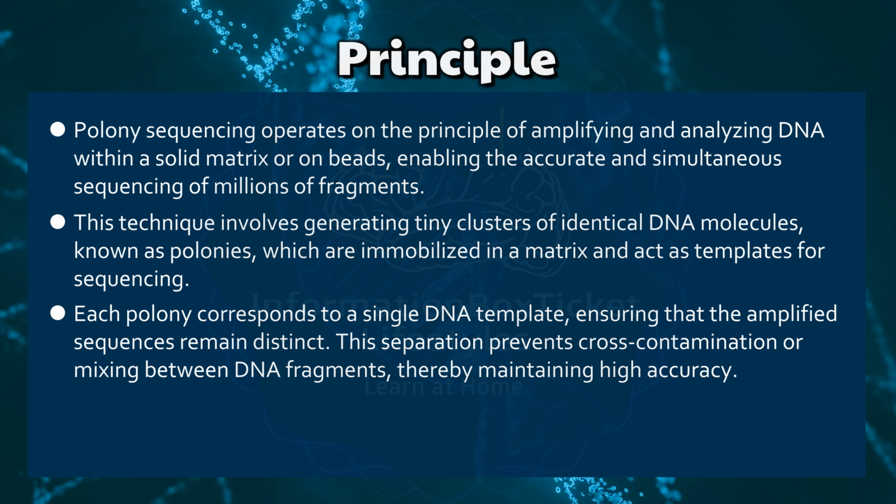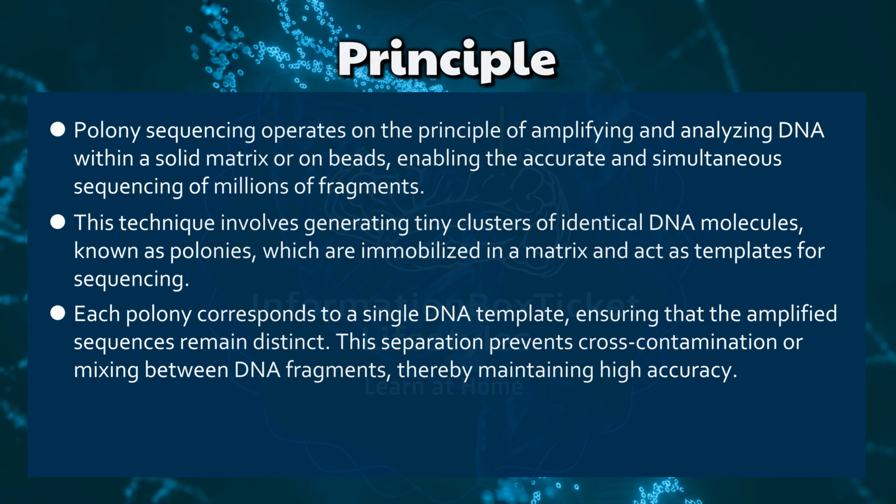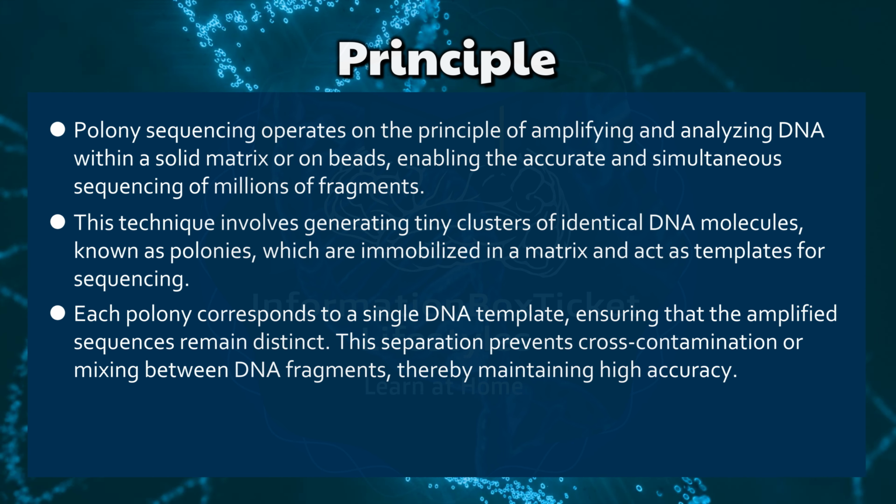Each polony corresponds to a single DNA template, ensuring that the amplified sequences remain distinct. This separation prevents cross-contamination or mixing between DNA fragments, thereby maintaining high accuracy. Sequencing is performed directly on these polonies using fluorescently labeled nucleotides to identify each DNA base.